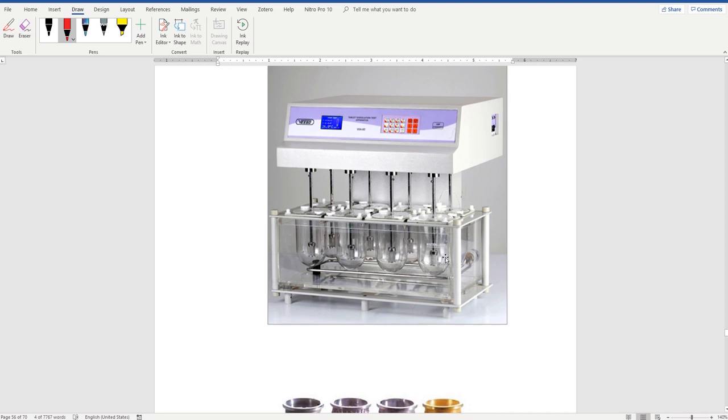Another very important thing is the pH of the specified medium. For example, let's say I said phosphate buffer, use as a medium phosphate buffer with a pH of 6.8. Then it should not be more or less than 6.8 by 0.05.